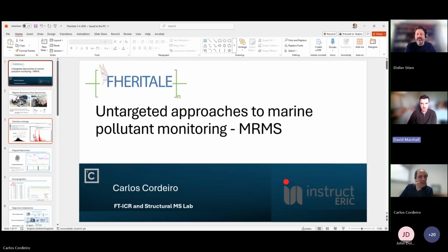Okay, I can see another comment in the chat from Ryan. I can read it out. So firstly, very interesting talk and nice photos. And then Ryan goes on to say, you showed the phytoplankton pigment metabolism was not affected by exposure to fluoxetine, although other metabolism was. So if you just look at phytoplankton pigment, then the effect of pollutant exposure may be hidden. Do you think we need to develop new techniques to check on the health of our environments?